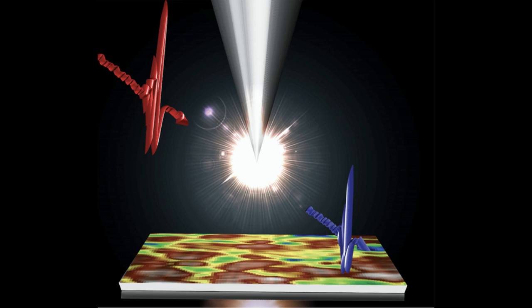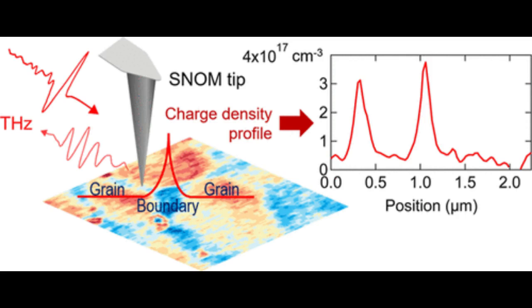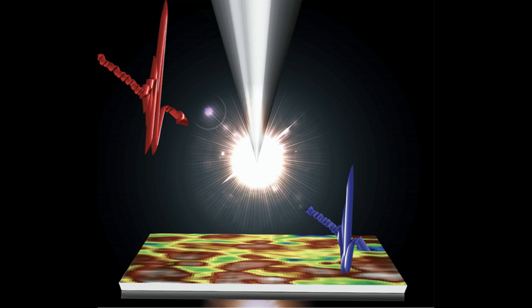silicon in solar cells. Richard Kim, a scientist from Ames lab, explained the two features that make the new scanning probe microscope unique. First, the microscope uses the terahertz range of electromagnetic frequencies to collect data on materials. This range is far below the visible light spectrum, falling between the infrared and microwave frequencies. Secondly, the terahertz light is shined through a sharp metallic tip that enhances the microscope's capabilities toward nanometer length scales.